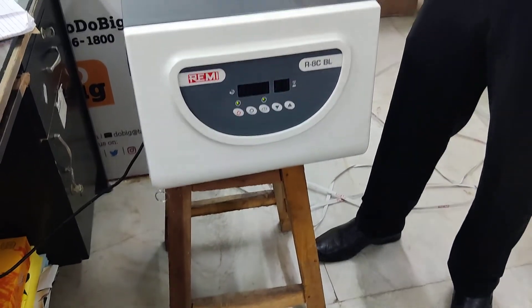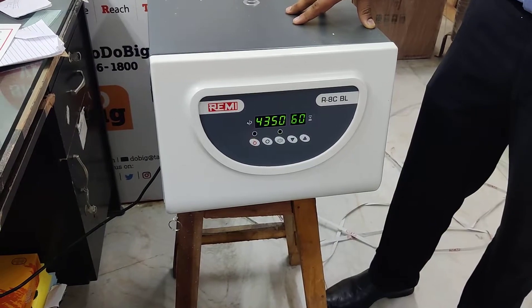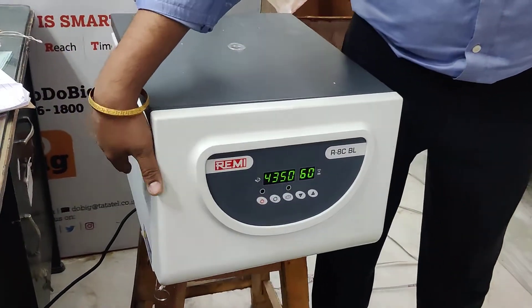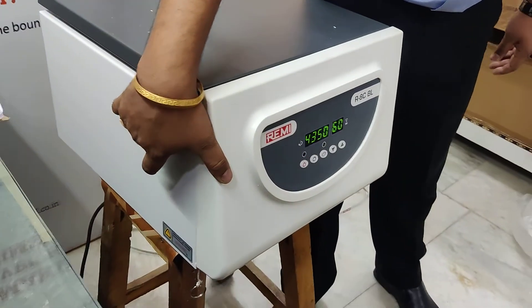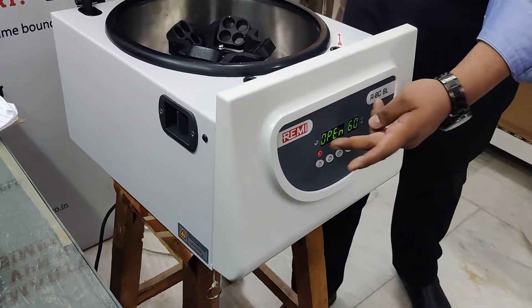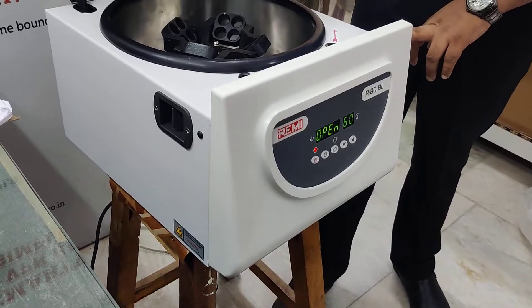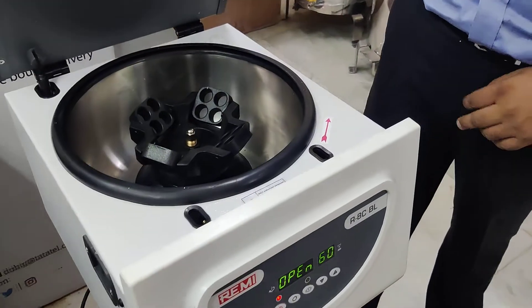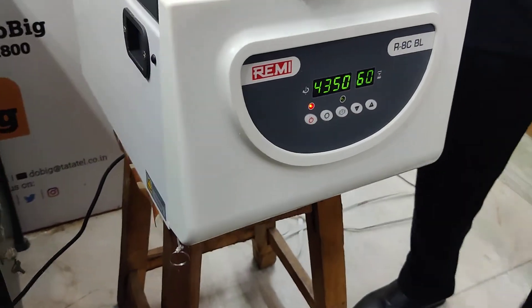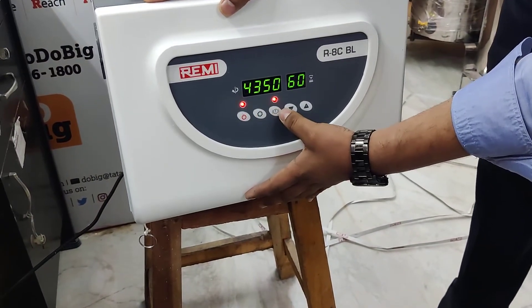Today we are demonstrating how to do the installation of the R8C BL machine. First, on the right-hand side of the machine there is one lever — you have to pull that lever to open it. Right now it is open. We have to load your samples. Once the samples are loaded, you have to close the lid.